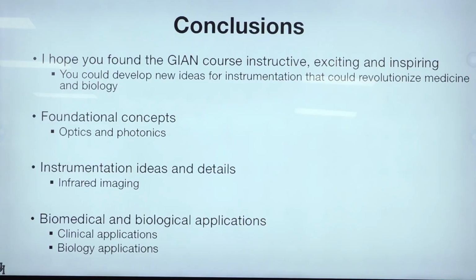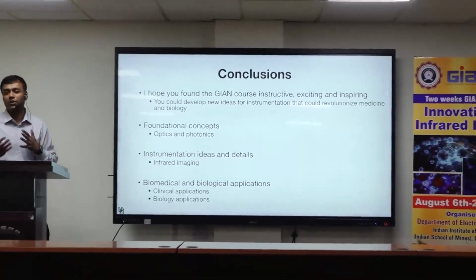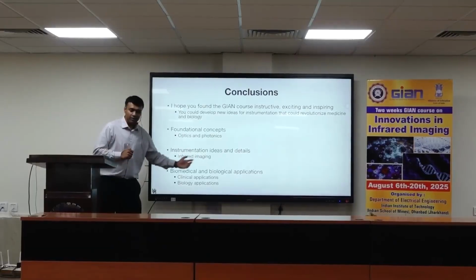Over the course of the past 10 lectures, I first tried to give you all the foundational concepts in optics and photonics, which I hope lays a foundation for you to study or learn anything else in the future. I also gave you instrumentation ideas and details of how many of these imaging systems work, and what the key concepts were, especially with a focus on infrared imaging.